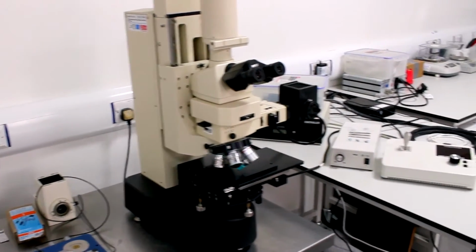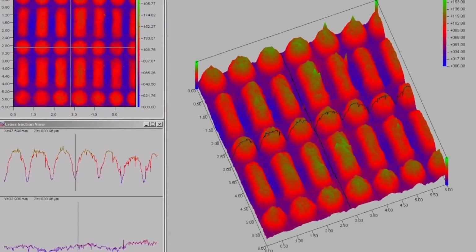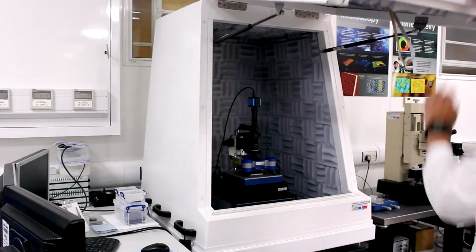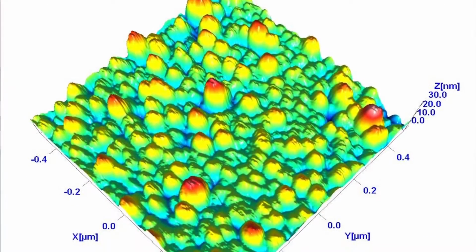The equipment we most often use would be a profilometer, an optical profilometer, which uses reflected light and the interference pattern generated from that reflected light in order to create a 3D structure of a surface profile. The atomic force microscope is a very powerful technique which allows one to resolve structures of surfaces and materials below the diffraction limit of light. So where you cannot get information on perhaps molecular shape and even atomic structure, one can use an atomic force microscope to determine these kinds of details.